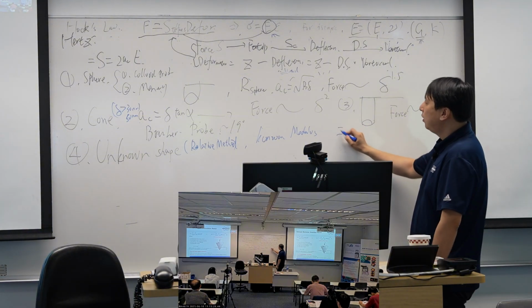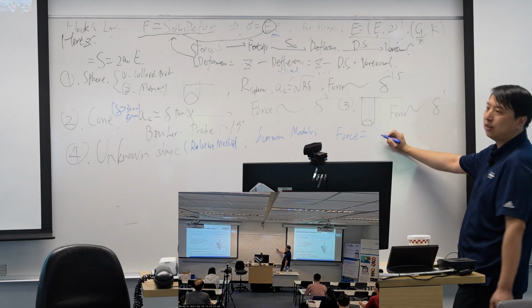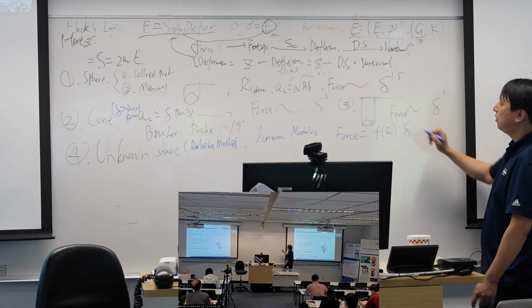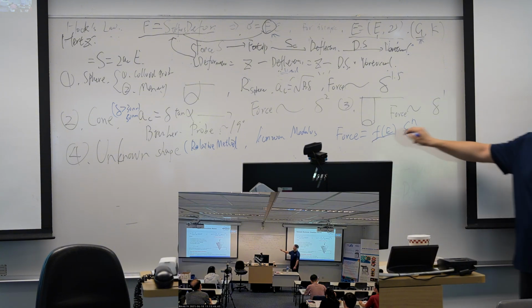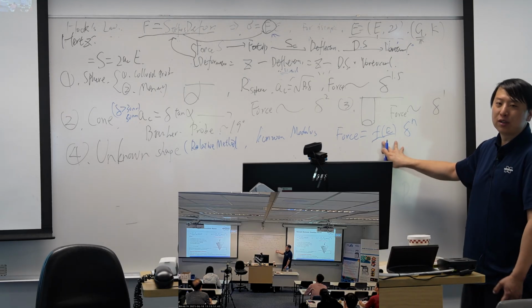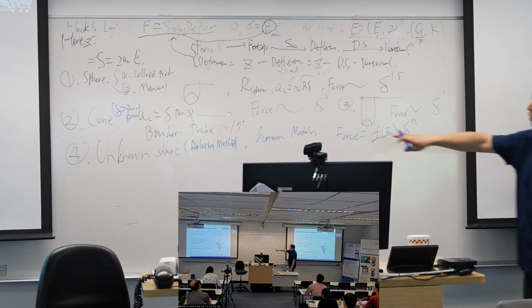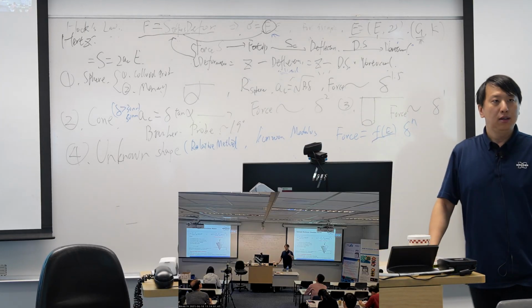Since we know the force is proportional to a coefficient, and this coefficient is a function of modulus times the delta n, if we do a force curve on these known-modulus samples, we can get the coefficient out. And then with the coefficient, we can do a force curve on my own sample, and then I can get the modulus. The known-modulus sample on the nanoindenter is unique.